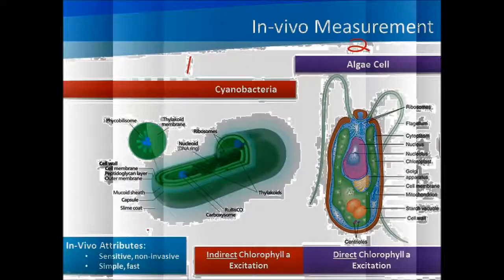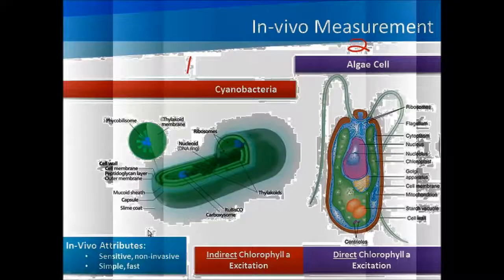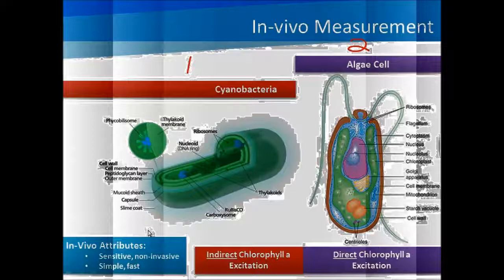We need both because of the difference between prokaryotic and eukaryotic cells, but we're going to stop at this level of detail. Brandon will discuss how this measurement is made in the technology section. Here I just wanted to outline why we need to measure both. So let's move next to try and interpret some data.